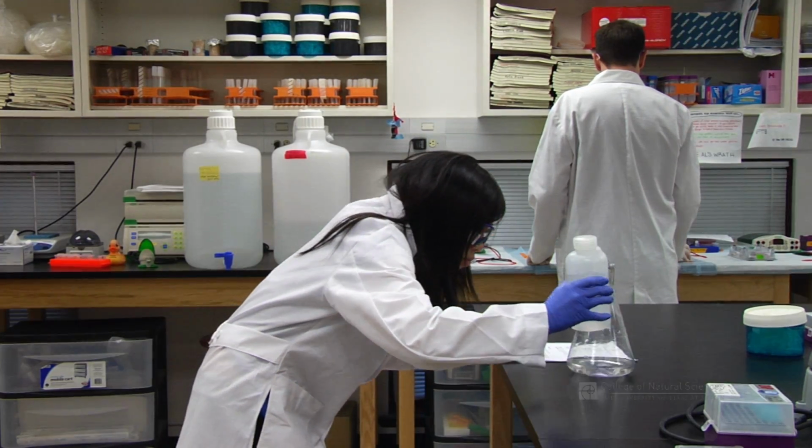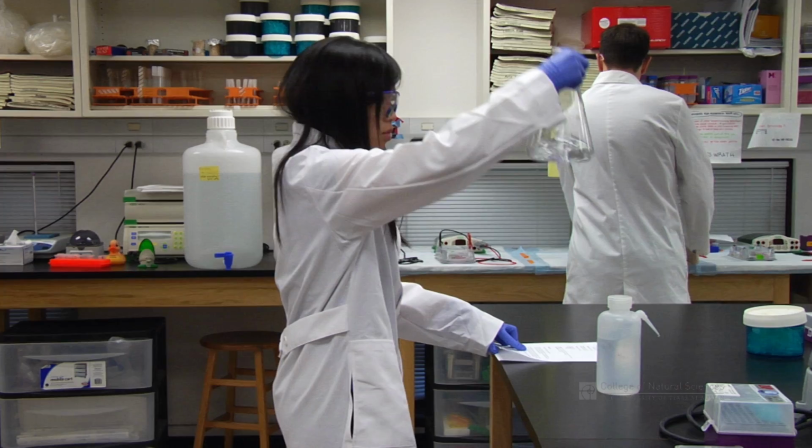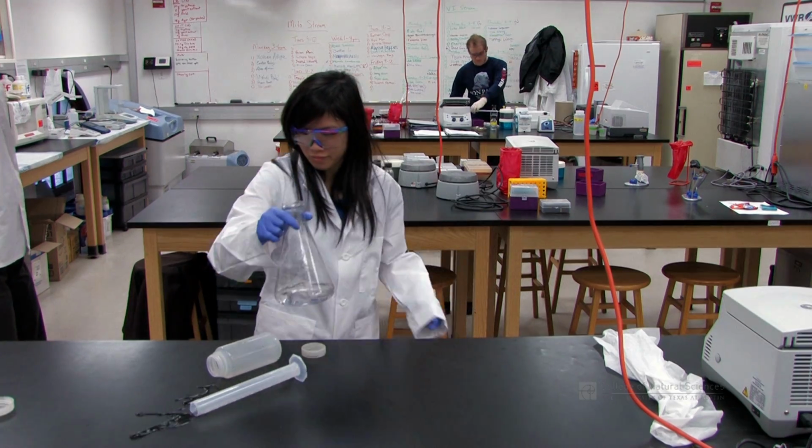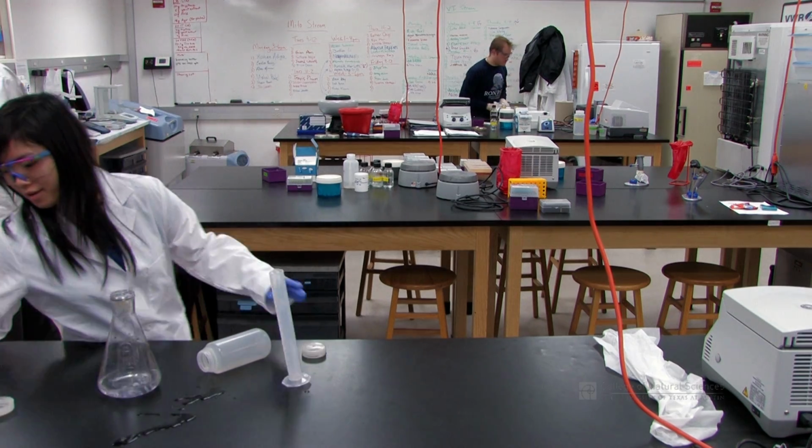In certain lab environments, you may have limited time to complete your experiments. In these situations, it is critical that you are well prepared before coming to lab. If you don't feel prepared to carry out an experiment, don't set it up at that time. You should never feel excessively rushed in lab. Rushing can lead to accidents and spills and will make you late for the very thing that you are hurrying to do.